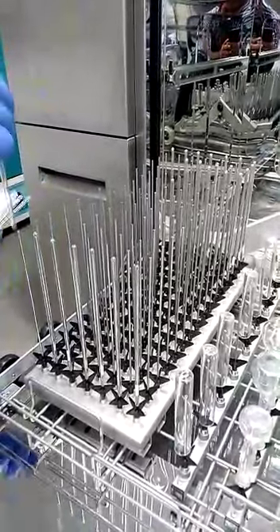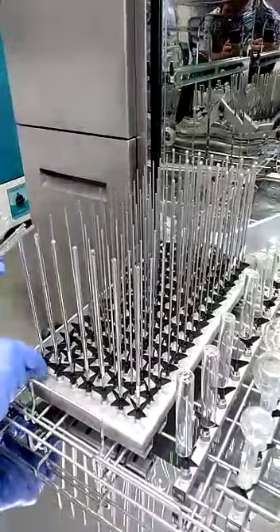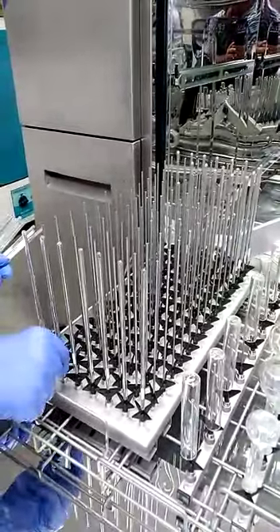I am putting the tubes one by one onto each nozzle. This nozzle can be adjusted up and down as per your convenience.